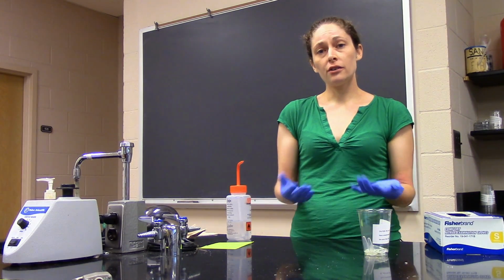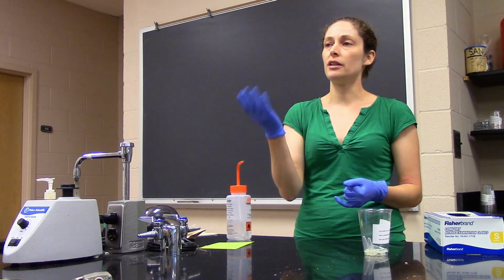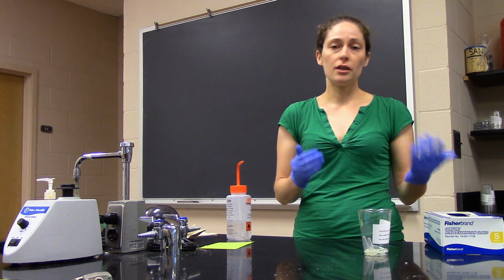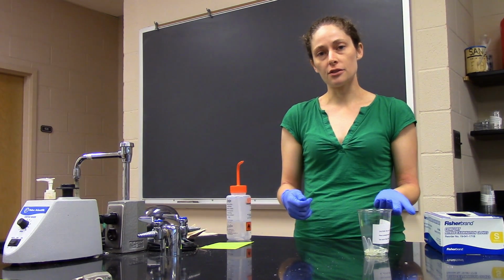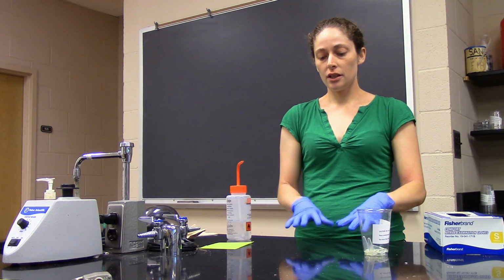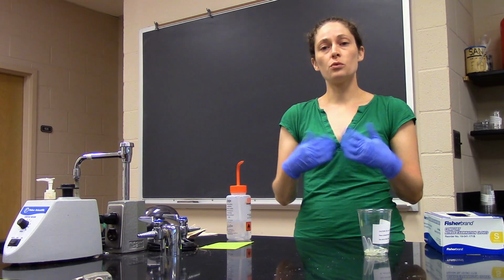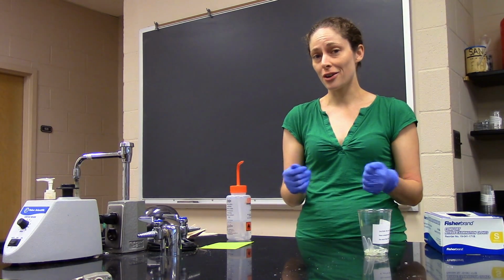Okay. Later on, you'll probably want to use other things for more sophisticated techniques. You might need to work in the fume hood, or you might need to use an open flame to create an updraft of your work area or help sterilize certain equipment. But for now, just bear in mind gloves, cleaning your surface, emptying the trash, working quickly, keeping things closed as much as possible, not talking while you're working.